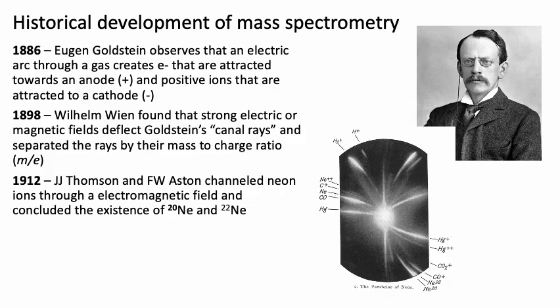And the difference between this and what Wilhelm was doing was that it was done under a vacuum with a photoplate. And the addition of the vacuum really helped the ability to identify these. Because if you don't have a vacuum, then you have too many particle-particle interactions and particles slamming into each other and deflecting each other, and then the ions don't actually make it to the photoplate. And we'll see this is also why we put mass spectrometers today under very high vacuums.